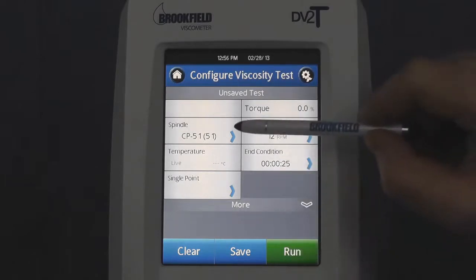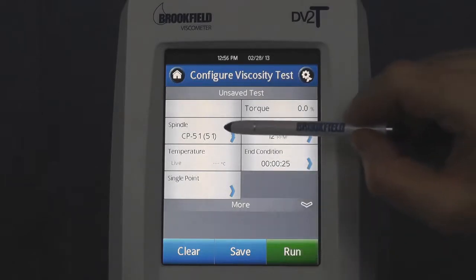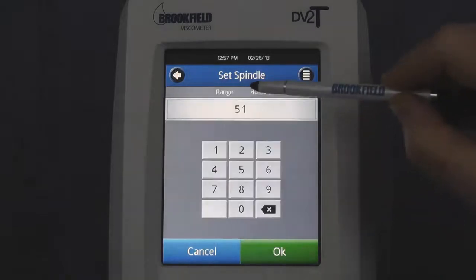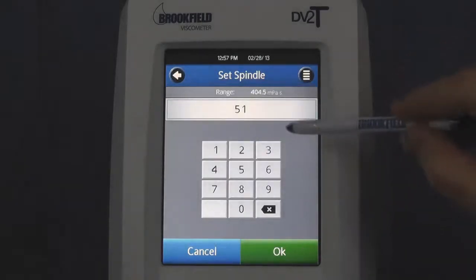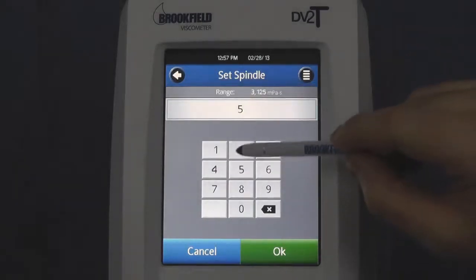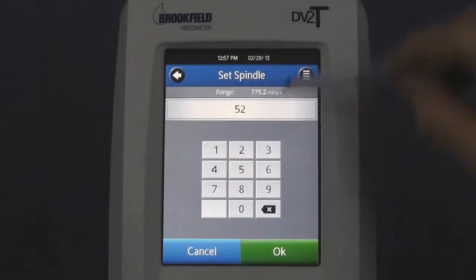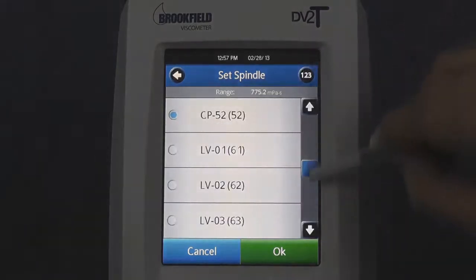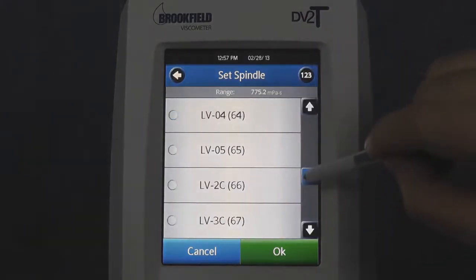A blue arrow in the field implies it is a value that can be changed, and once pressed, you could enter that value manually, or you could press the list icon for a pre-selected list of values.